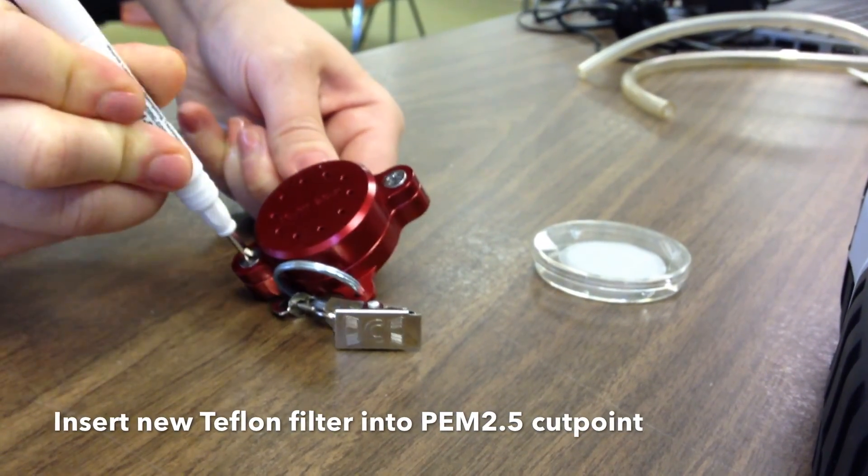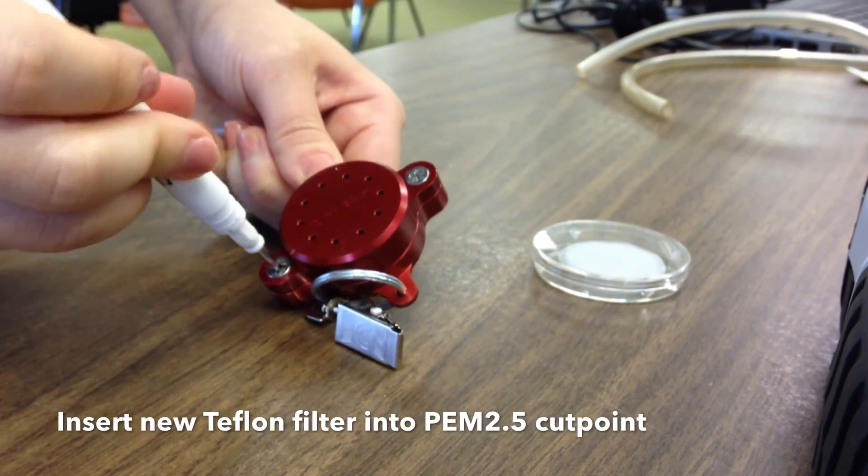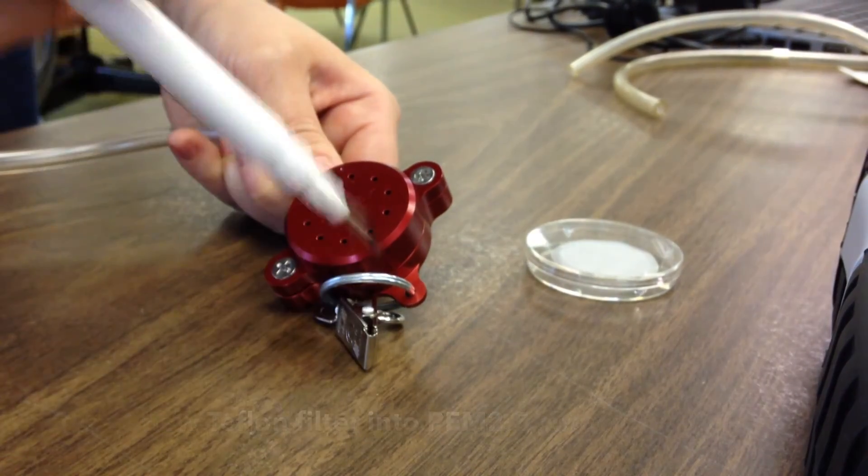Before sampling, a new pre-weighed Teflon filter must be placed into the PEM 2.5 cut point.